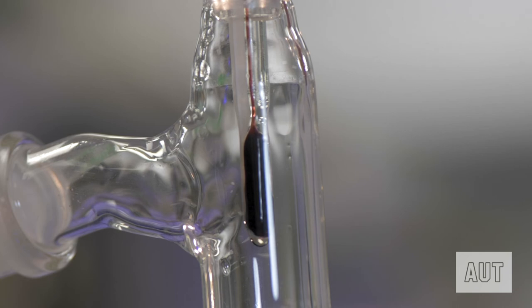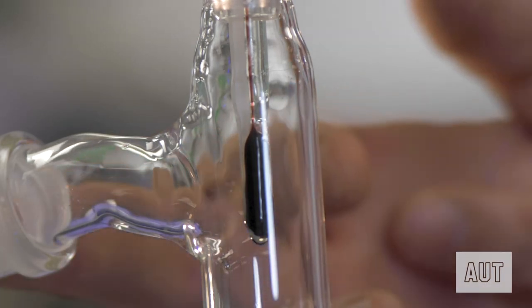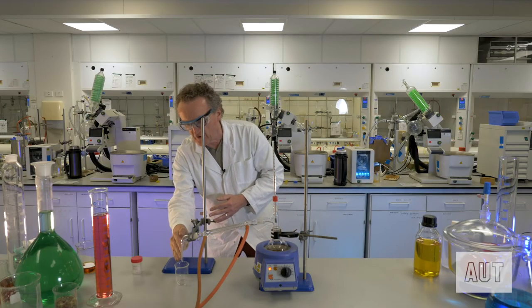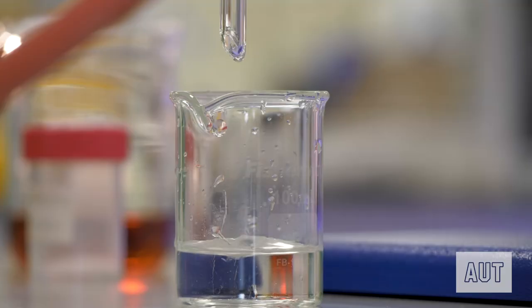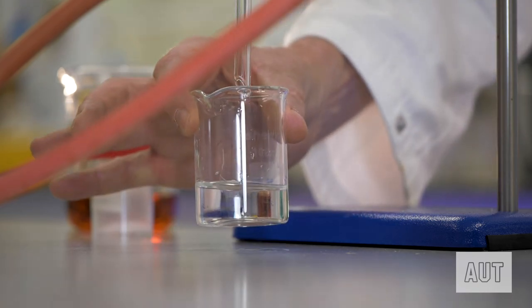So what will now be happening is that the vapor has reached this point. It will now be traveling down this tube here. It'll hit the cold condenser and it'll start condensing, and in the not too distant future we're going to see some drips coming out of here. And there are the drips. Okay, so there is your pure liquid coming over now.